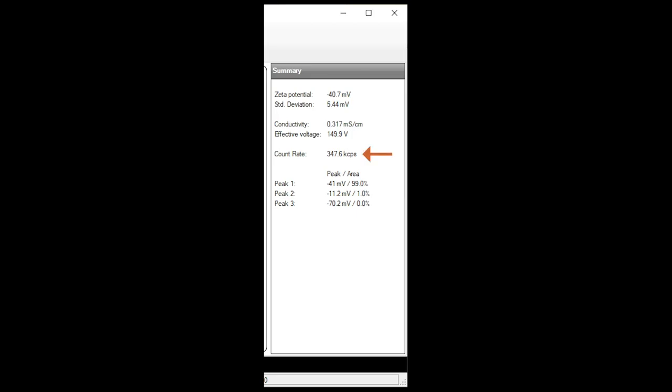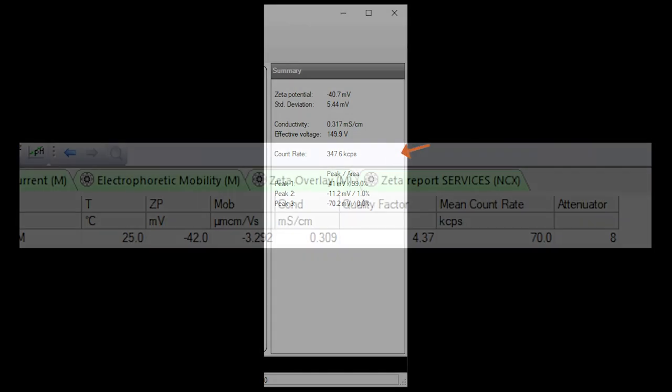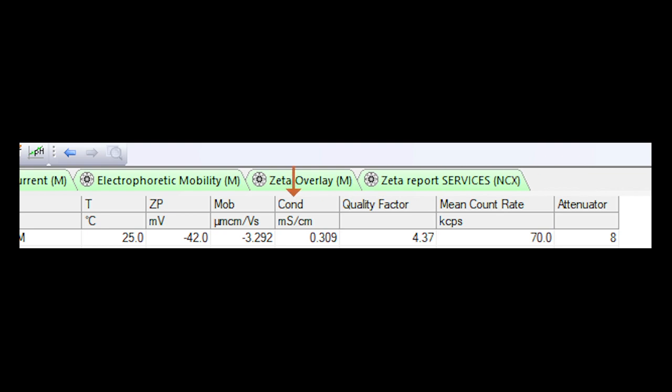While the sample is measuring, pay attention to the signal or count rate, attenuator setting, conductivity, and quality guidance. We'll cover this and more in part 3.